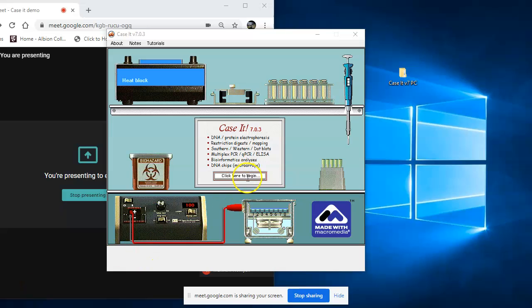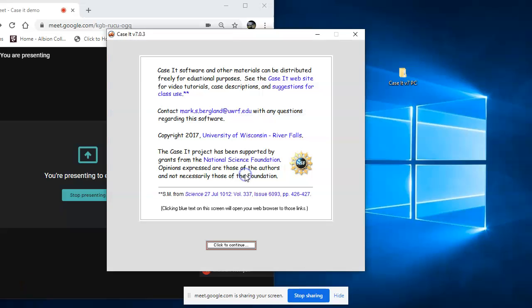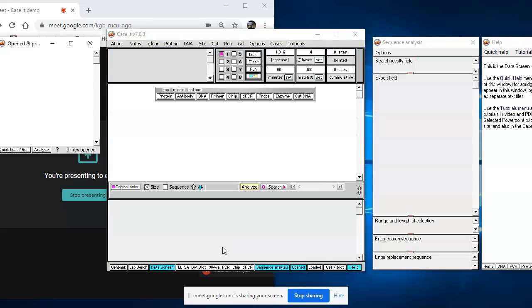All right, ready to go. So you click here to begin. And you get this info, you click to continue. And hopefully everybody got to this point.